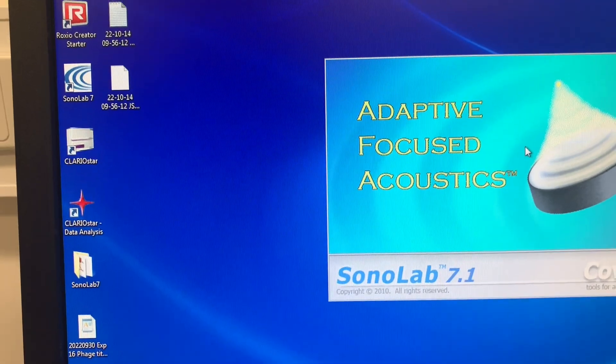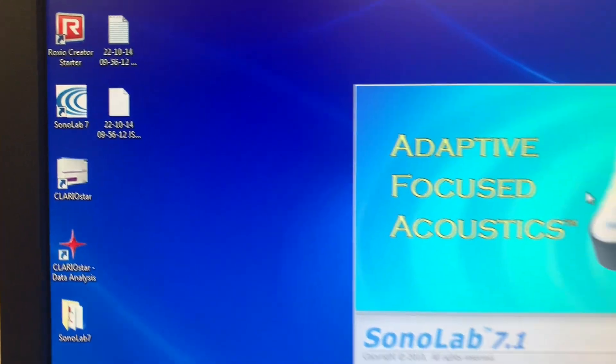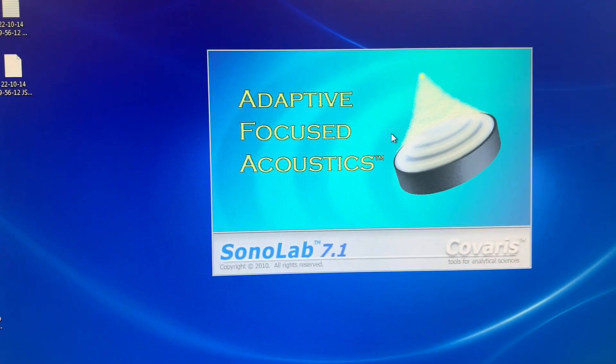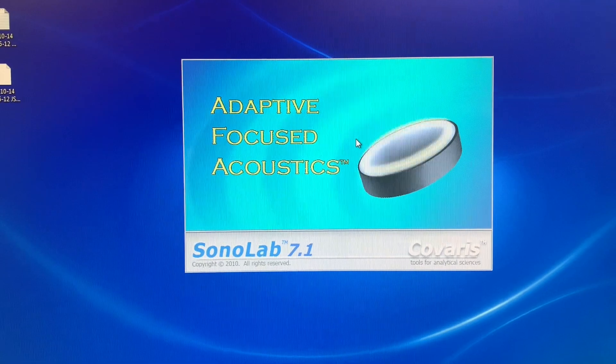you want to turn on the software that will actually drive the program. This is when you're going to be selecting the actual program that you want to use or creating the program you want to use in order to fragment your DNA.